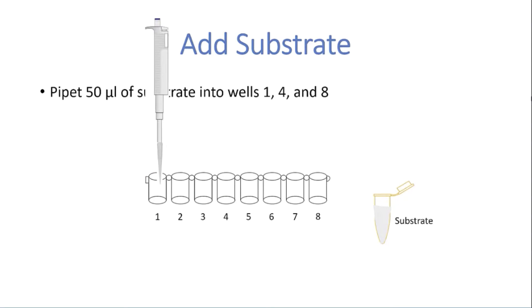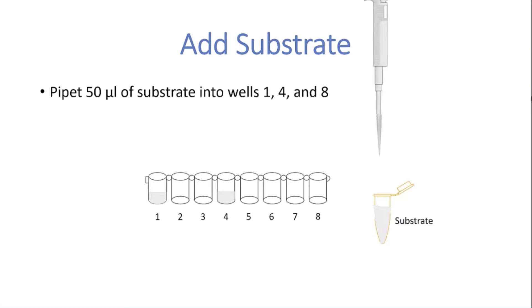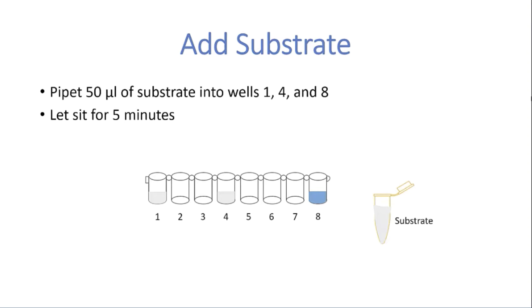Now the substrate is added. 50 µL of substrate is pipetted into wells number 1, 4, and 8 and allowed to sit for 5 minutes. The negative control should remain colorless while the positive control should turn blue. If the sample in well number 4 remains colorless, the sample is negative. If it turns blue, it is considered positive.